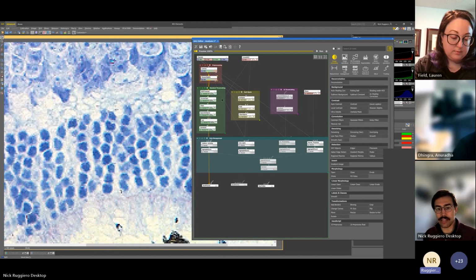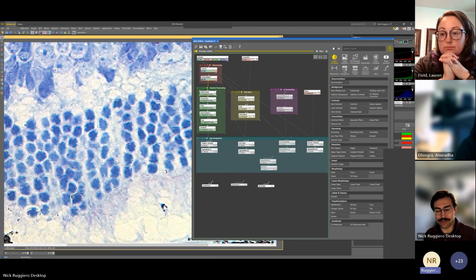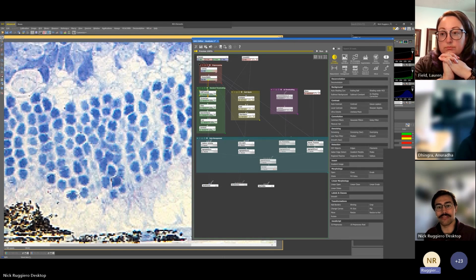And it's nice, like we mentioned before, sometimes we can work backwards. The first thing that I actually tried was without any pre-processing. I just attached this threshold directly to my RGB channel. And I was really struggling to segment out these nuclei from each other. So I decided to put in some pre-processing, and that ended up helping a lot. You can see we have our bar chart here.